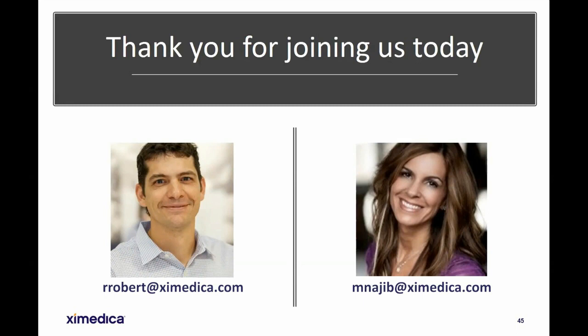Here's a question around library prep and FDA submission. If a manual library prep process is cleared by the FDA now, why would you want to automate it? Wouldn't that make the submission process more complex and slower? Martha, why don't you take this one?